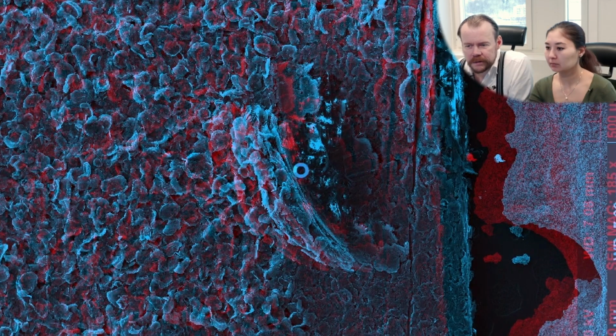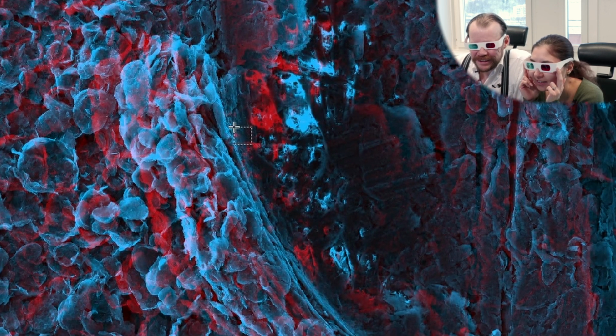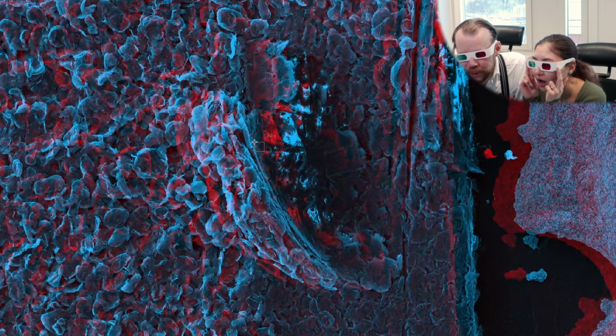Hold down. Oh no, look. What did you do? Oh, okay. Yeah, it works with the keyboard at least. Now, do we see it now? Yes, now I do. So now we can see it. You see this very big thing, and it's like a pitch down. You see there's a hole, and almost like something has been penetrating in.